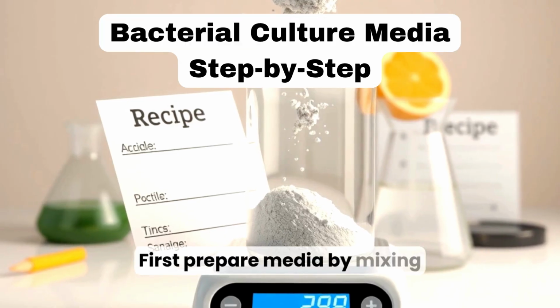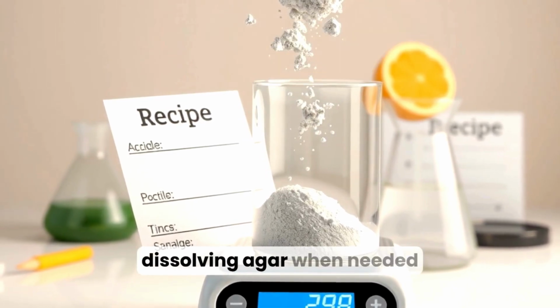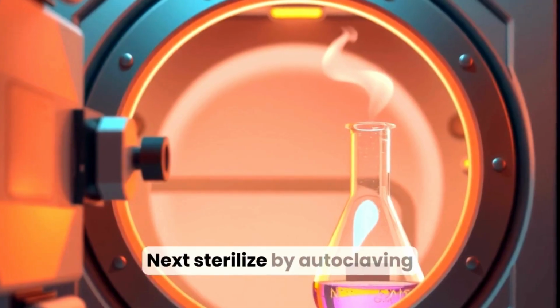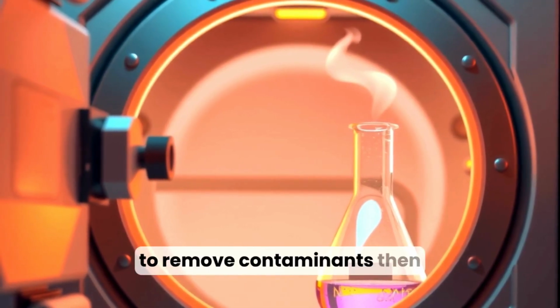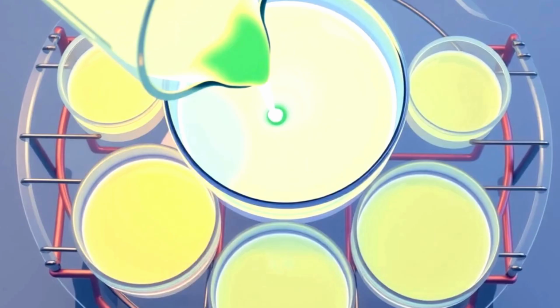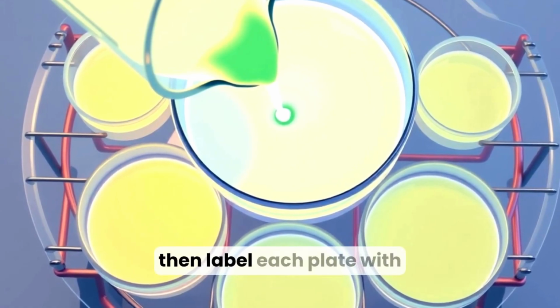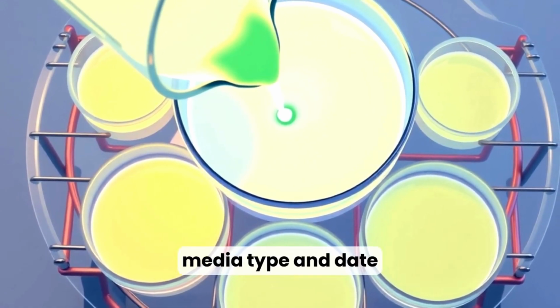First, prepare media by mixing components accurately according to the recipe and dissolving agar when needed. Next, sterilize by autoclaving to remove contaminants, then cool to a safe pouring temperature for plates. Pour agar into sterile Petri dishes, allow solidification, then label each plate with media type and date.